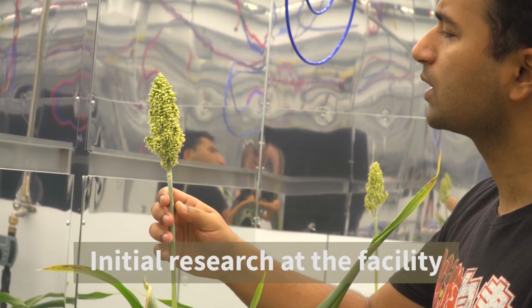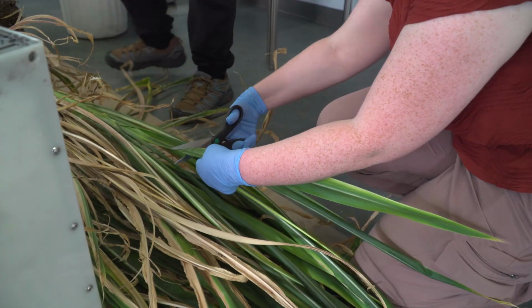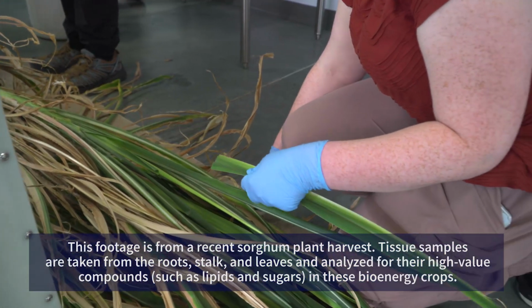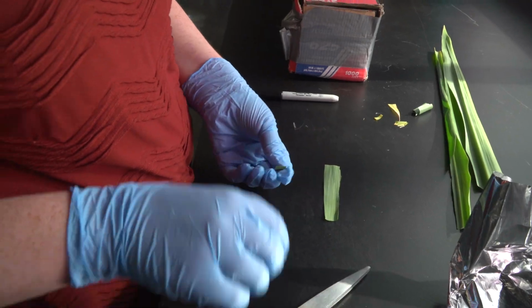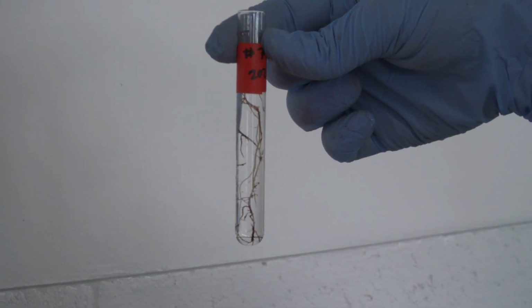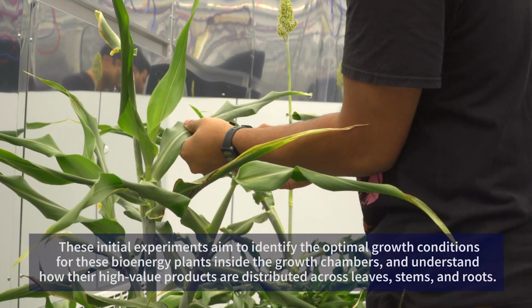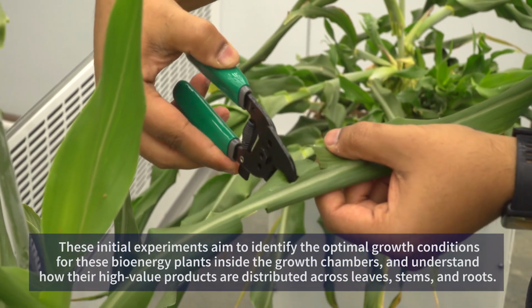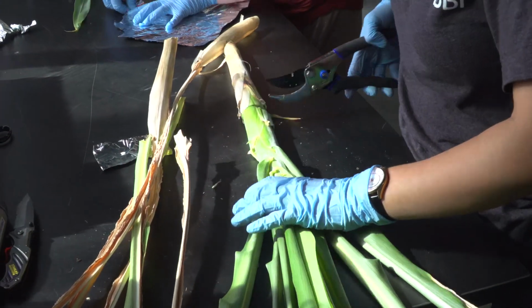In this initial round of experiments, we're simply growing the plants and learning how to harvest them and preserve the plant tissues so that we can do the analysis of the specific compounds that contain the isotope tracer. As we harvest our experiments, what we're looking at is specific compounds within different plant tissues so that we can understand where the high-value products such as lipids are being produced and how we may better achieve our targets of increasing the lipid content of our crops.